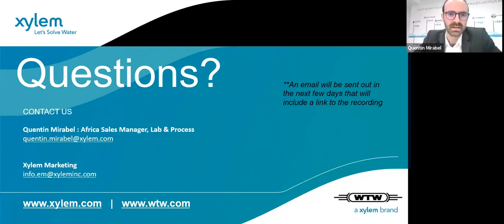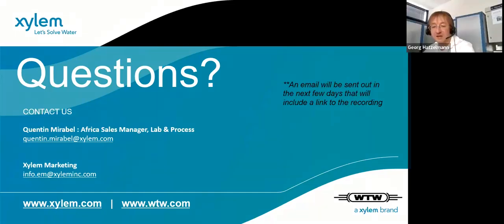Okay, thanks. We do have a lot of questions. Thanks, Georg. We are arriving at the top of the hour, but let's answer them. What is the measuring time for measuring COD? The measuring cycle of the sensor for one measurement is around 1 minute.